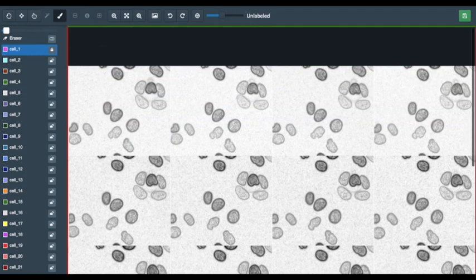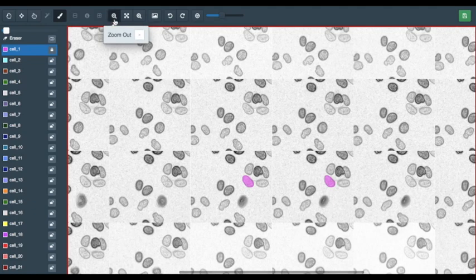Finally, we have adjusted the contrast on these images to make the cells clearer. However, this occasionally results in artifacts. Remember that cells are oval or bean-shaped, so any dark regions or cell-like objects, like here or here, are artifacts and should be ignored. After you have accurately colored in all the cells in the image, you are ready to submit.